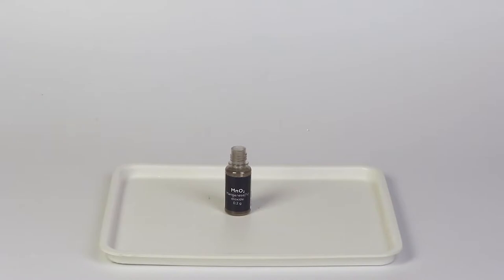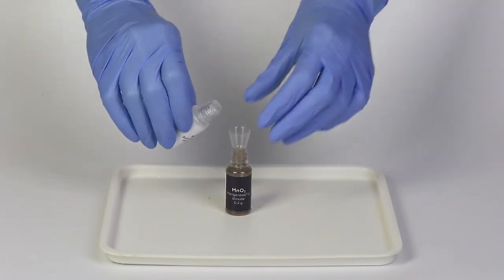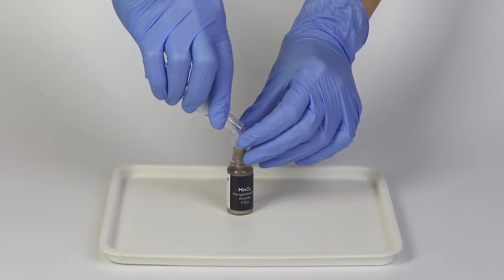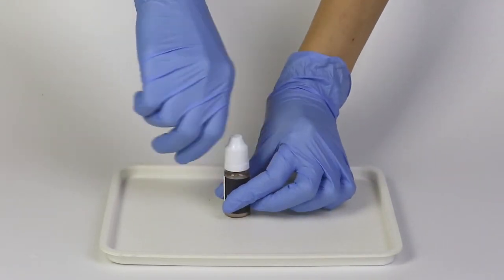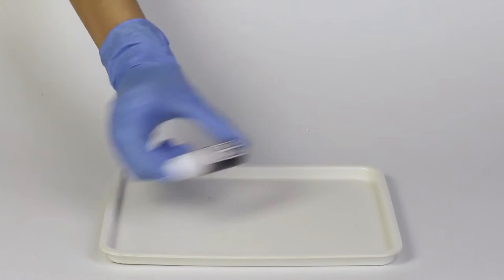Insert the plastic funnel into the bottle of Manganese Dioxide and pour one bottle of Sodium Chloride into it. Close the bottle with a cap and shake it vigorously for one minute.